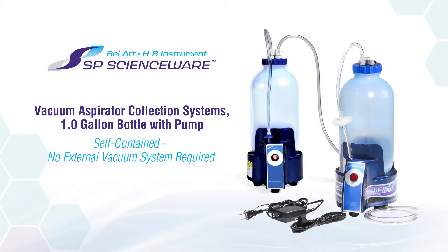SP Scienceware's vacuum aspirator collection systems are ideal for the aspiration of a variety of liquids, including tissue culture media, supernatants, and chemical wastes.